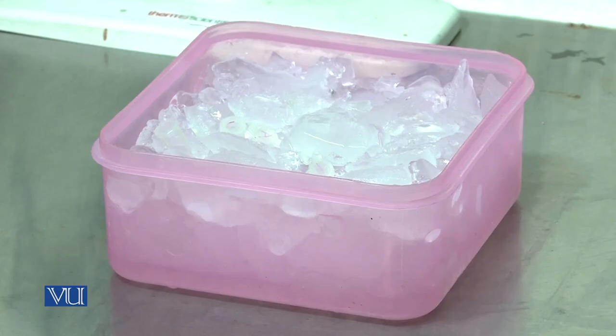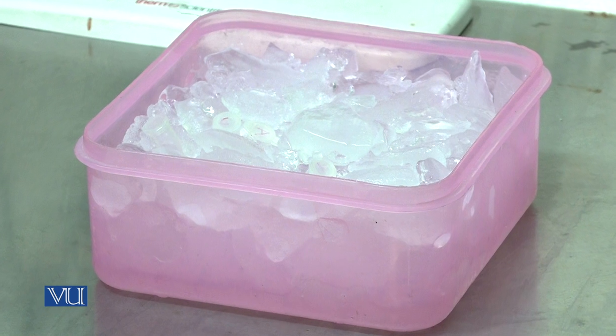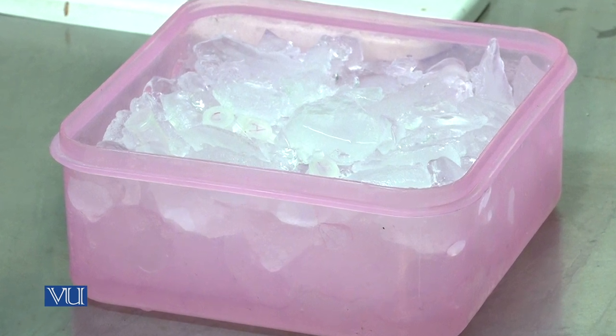So we start our experiment. We need two things first. Number one, competent cells which are already prepared and stored on ice or 4 degrees centigrade. And number two, our DNA of interest, which is plasmid in this case. We will mix 1 microliter of plasmid DNA with the competent cells aliquot already thawed and put on ice. Then after mixing, this mixture is allowed to incubate in ice for about 20 minutes.